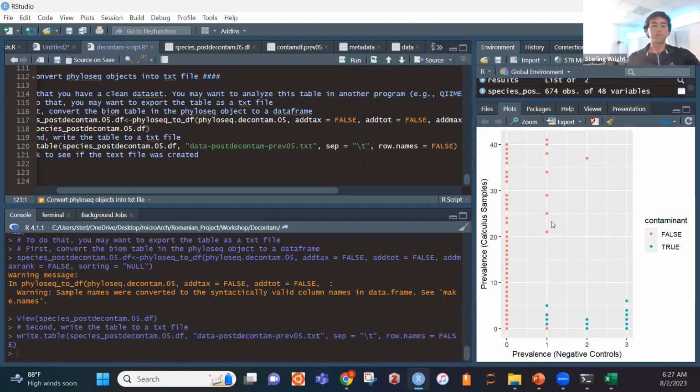In our case, this can be very critical for understanding whether we are potentially just picking oral microbes up in our lab. I mean, people have to breathe. We're wearing masks and taking all these precautions. We have all this personal protection equipment and safety gear on, but that doesn't mean it's foolproof. So just to make sure we validate that what we're doing is correct, we still have to perform analyses like decontam to ensure that we're removing any potential contaminants.